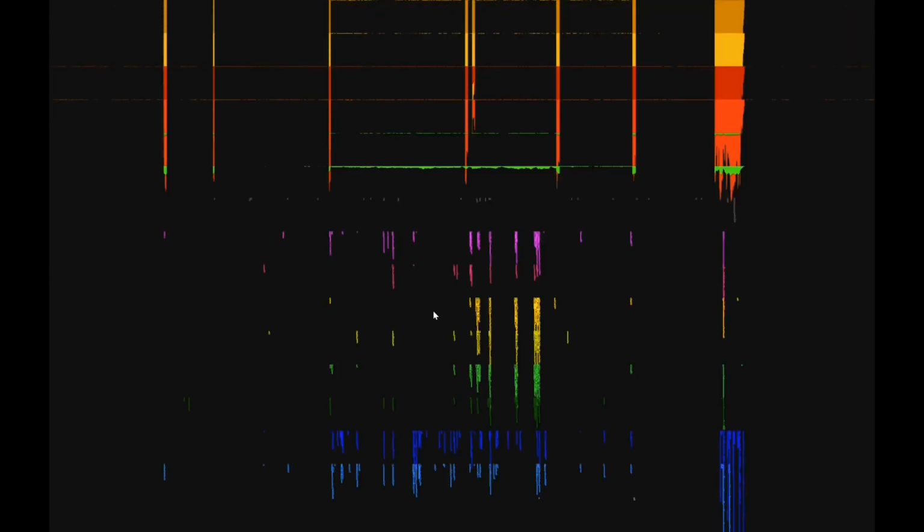chromosome view. In conclusion, we are excited to share with you our vision for the future of genome data visualization and our passion to create a tool that will be instrumental in the rapidly expanding field of genome research.